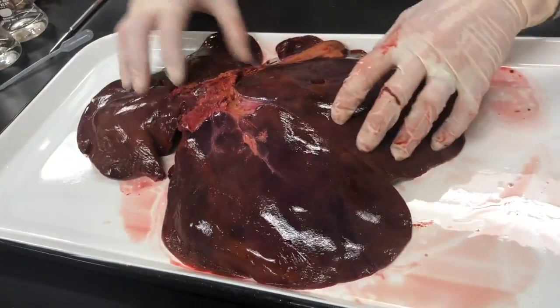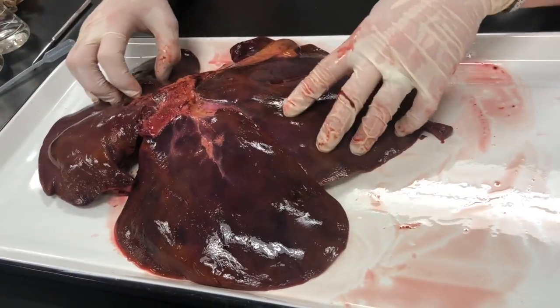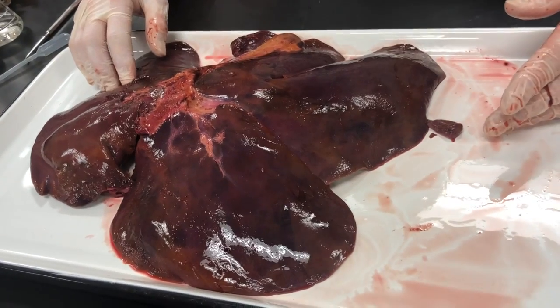So the pig's liver has 4 lobes to it. I think ours has 3 or something. So a little bit different, but nothing really significant.